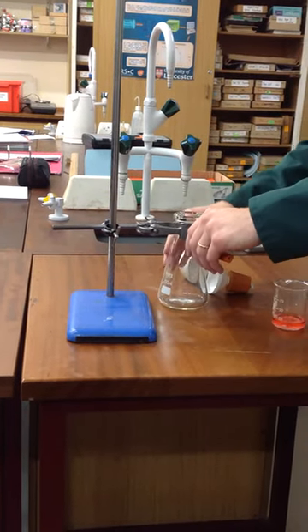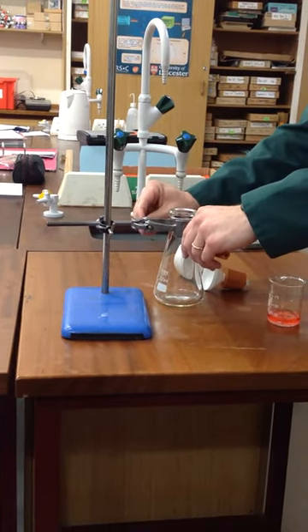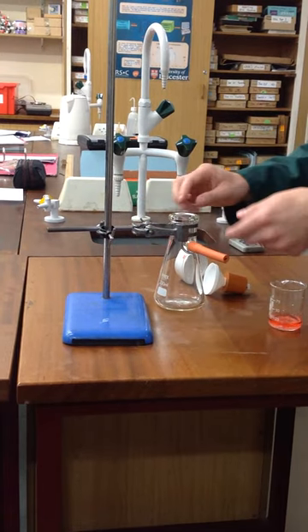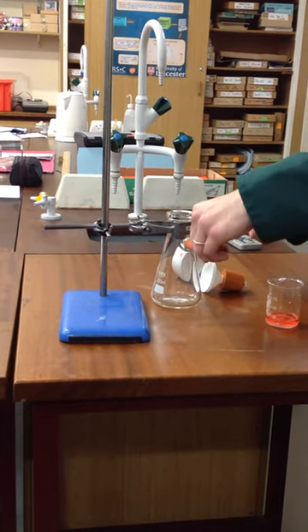So what we need here is what's called a Buchner flask, which is basically just a glass flask with a sidearm and a little tube coming off it.